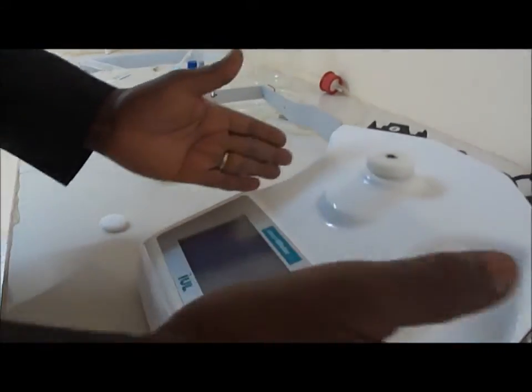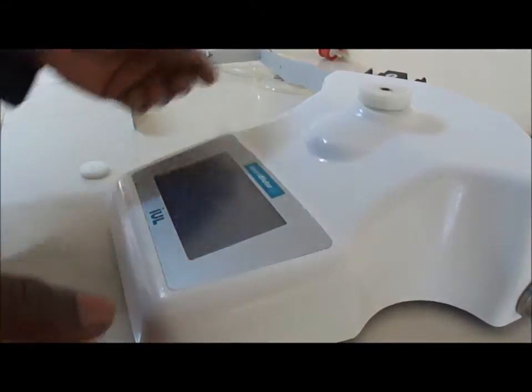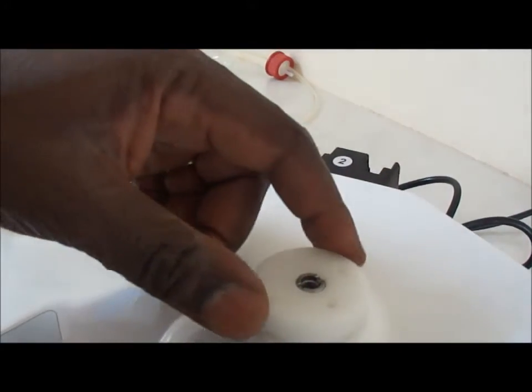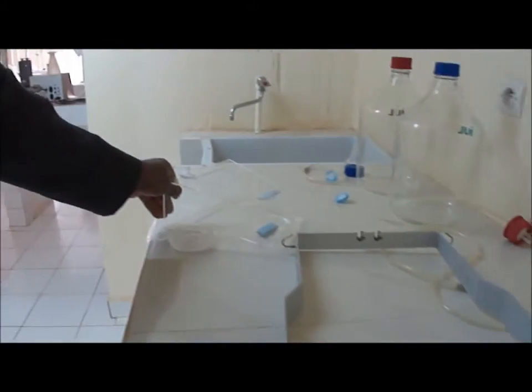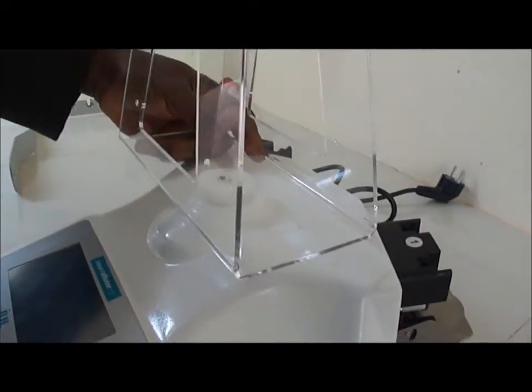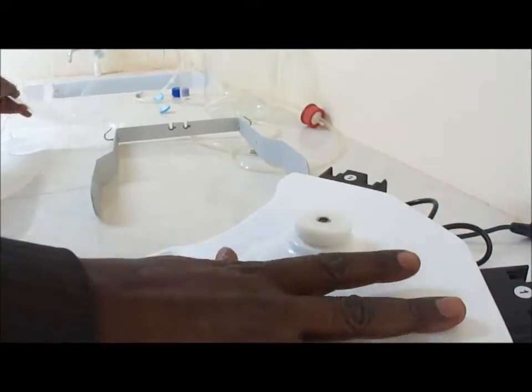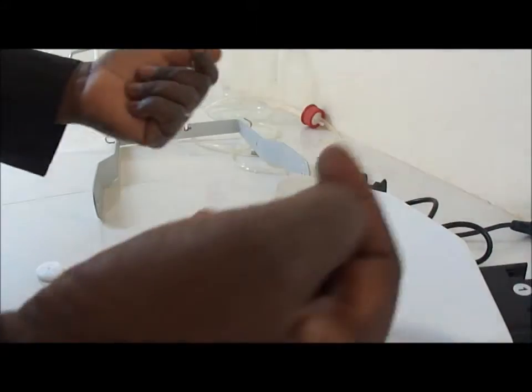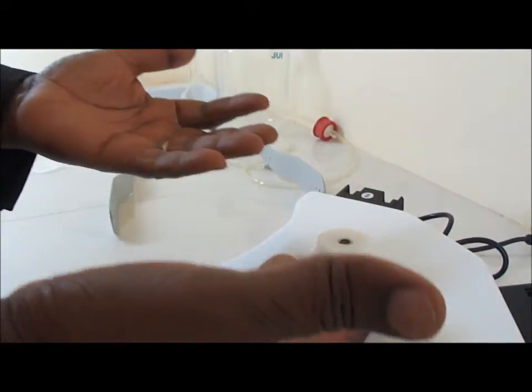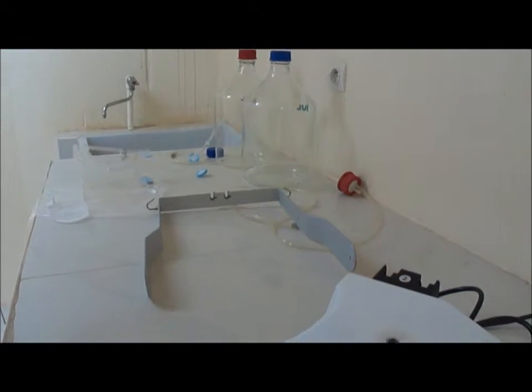And it's good to know that actually this is a scale. Inside you have an automatic electronic scale, which is sensitive from the top here. And we will mount the support, that is the third set of elements, the support here, and inside the support you will have the sample that will be weighed first, and when the central device is working, it will pump the diluent and mix it with the sample, and the factor of dilution will determine which amount of diluent will be mixed with your initial sample.